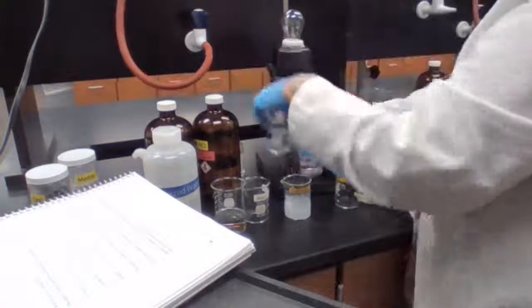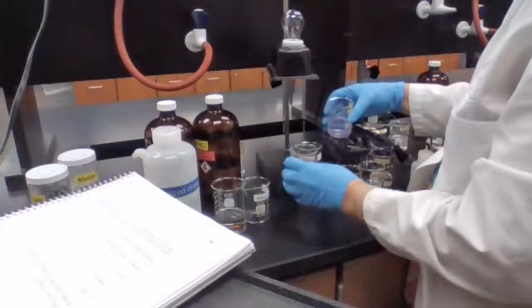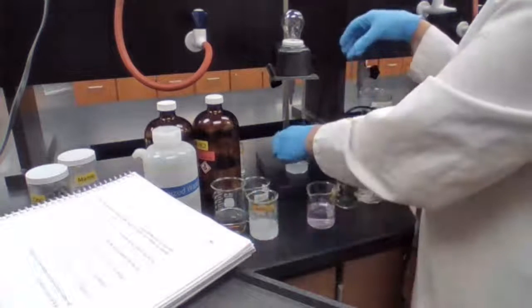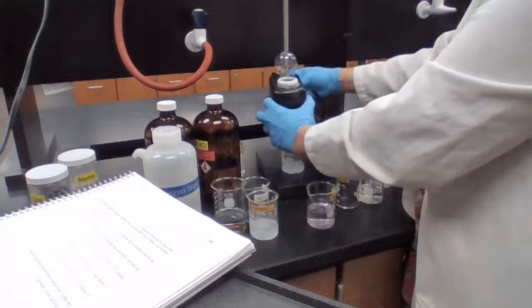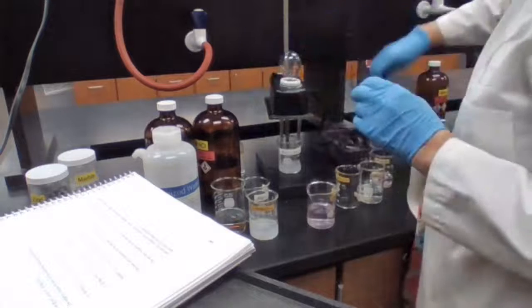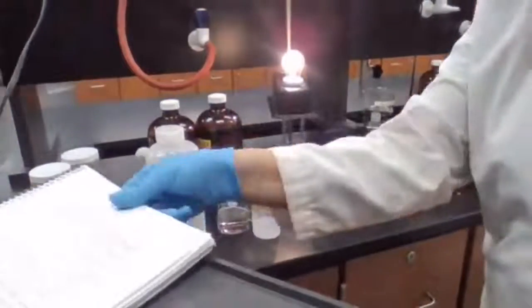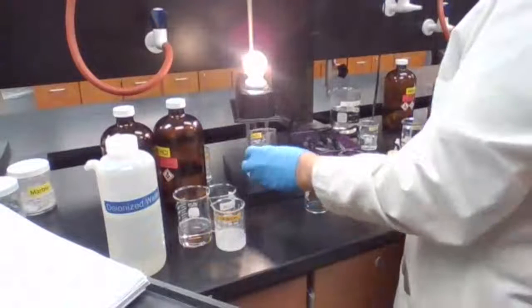I'm going to put some barium hydroxide, and slowly I'm going to add sulfuric acid. So you're with me? Okay, going to add sulfuric acid slowly.